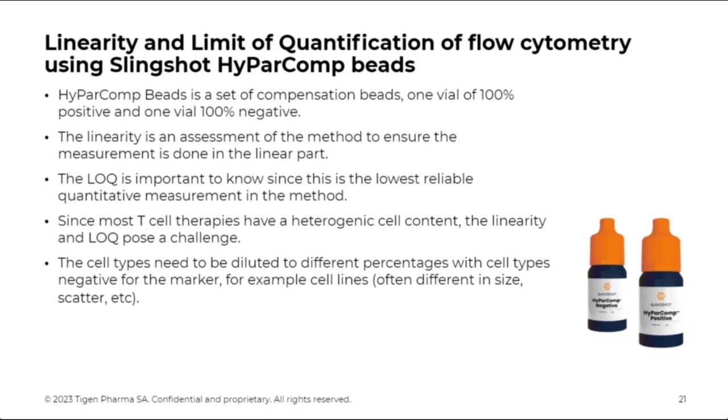And so what we did, many times you have your cell type, for example here, the T cells, and if you have a sample with 100% T cells, you need to dilute it down to 80, 60, 40, 20, and 0% when you assess the linearity. It might be difficult sometimes to find a cell of different cell type. Many times cell lines are used, but they have slightly different properties to what a lymphocyte is having, and this may pose a challenge and may not be the best option.